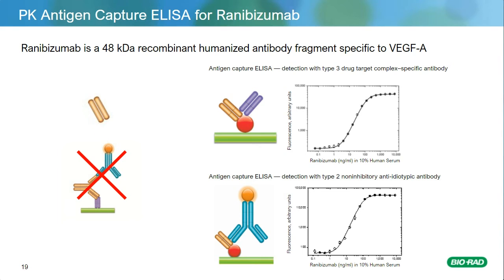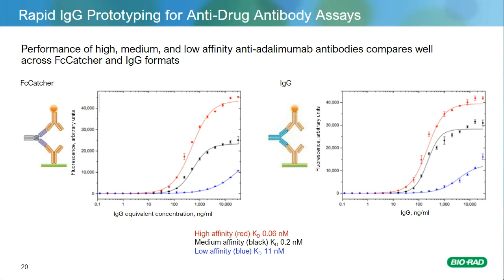Whilst pharmacokinetic assays have been a theme in this presentation, we know that a lot of the reagents we generate as capture or detection reagents for PK assays are also used as positive controls in anti-drug antibody assays. So I wanted to include a slide on how anti-idiotypes, again shown in purple or blue in this diagram, can be used as positive controls or serology controls in these kinds of assays.